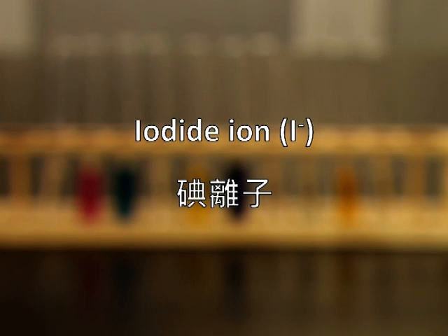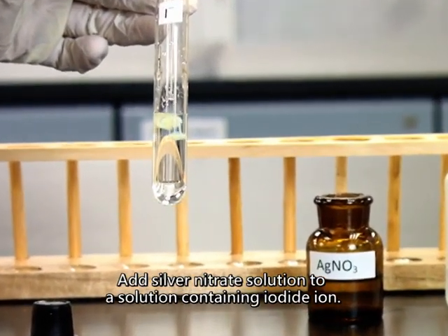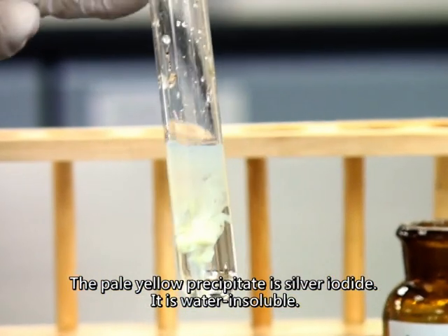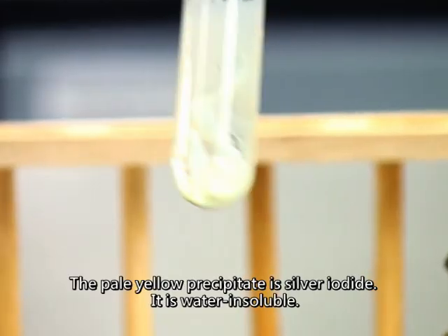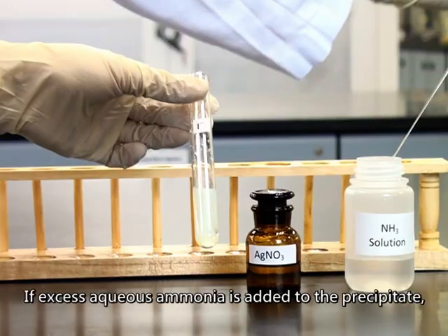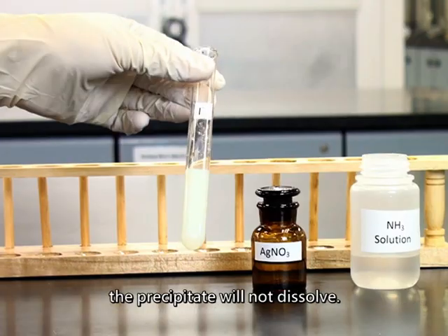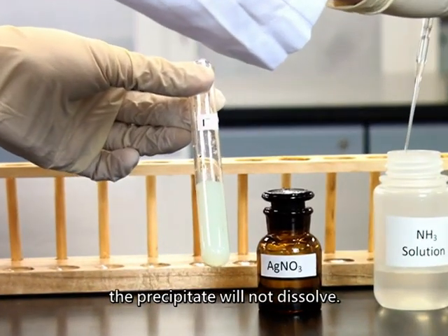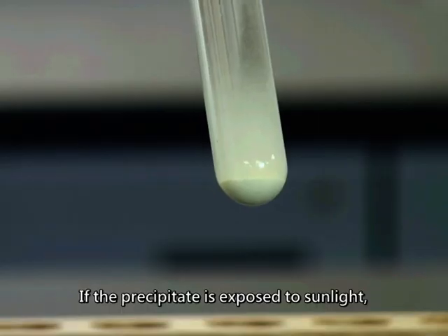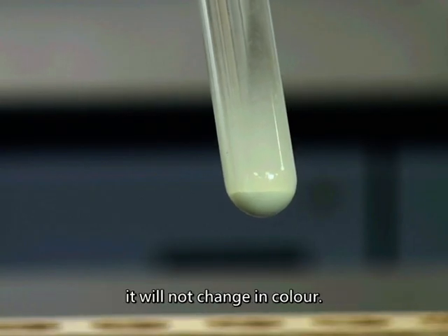Iodide ion. Add silver nitrate solution to a solution containing iodide ion. A pale yellow precipitate is formed. The pale yellow precipitate is silver iodide. It is water insoluble. If excess aqueous ammonia solution is added, the precipitate will not dissolve. If the precipitate is exposed to sunlight, it will not change in color.